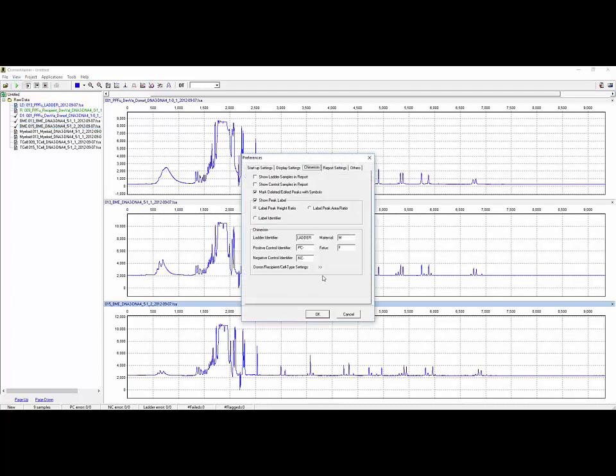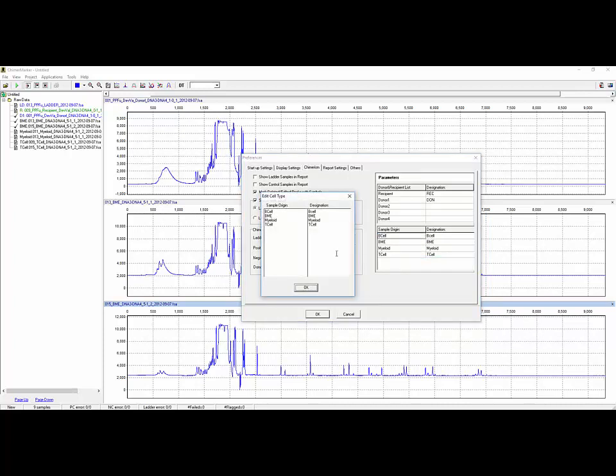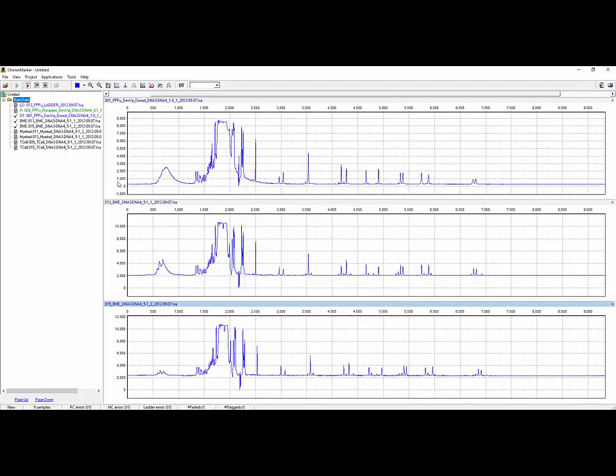At the very bottom, there's going to be options for the donor, recipient, and cell type settings, and we can open this window and set in our designations for the recipient, donor, along with the cell types. In order to edit the cell types, you need to right-click, click Edit Cell Type, and a text file dialog will open where you can enter in your different cell types and click OK. Once you have these set, we'll click OK again, and your preferences are going to be applied.